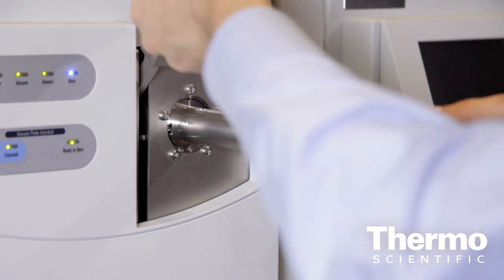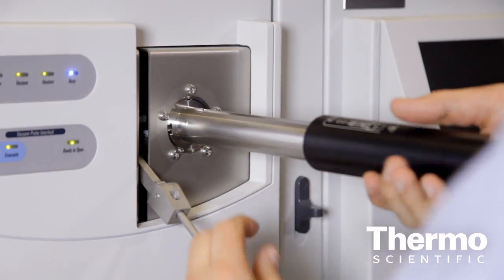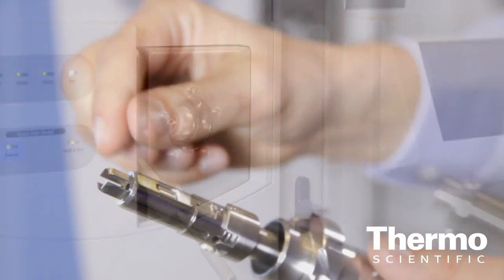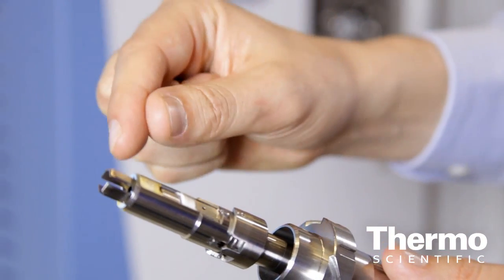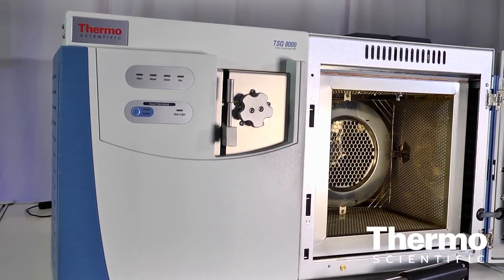We have the ability to remove the entire source without venting the system. Any part in the source that requires infrequent maintenance, you can pull out of the source block without venting. This basically allows you to be up and running again within an hour or two rather than a full 24 hours, like is typical for a GC-MS system.